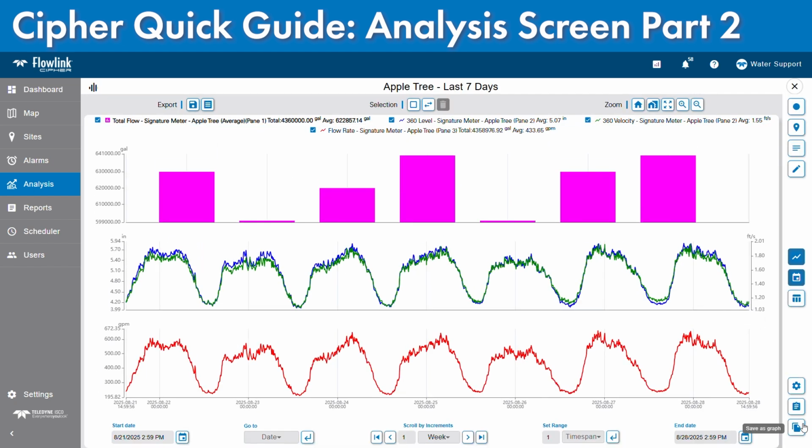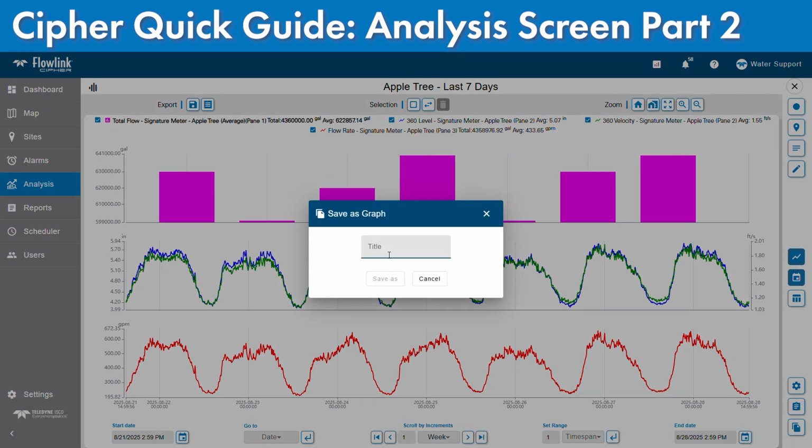And then finally, this last one, this allows you to save the graph as a different name. The point of this is if somebody else is sharing a graph with you and you open it up and it's not something that you made, you don't have the ability to make changes to it. So therefore, this little icon here will not be available to a graph that you did not make because it's not your graph. However, a workaround is you can make a copy of that graph by having it open and clicking on this, and you can simply just change the name and call it my graph as an example.